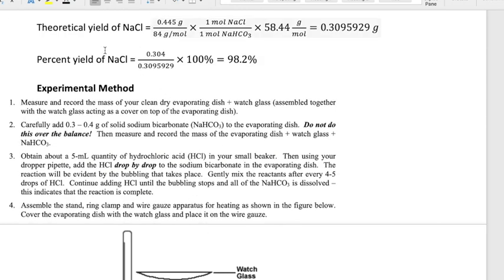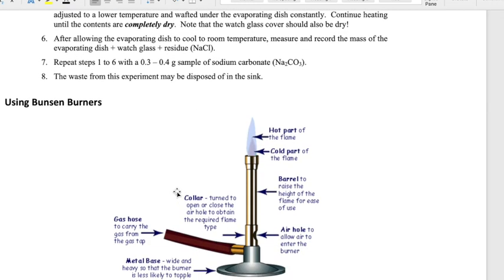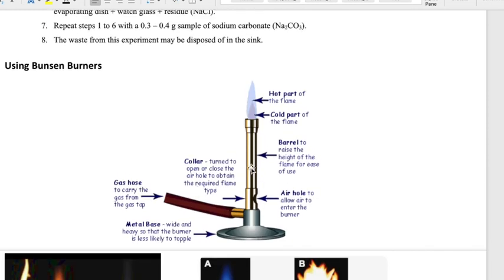A note about using Bunsen burners: a Bunsen burner has different parts that are important to know in order to control the flame. There's a tubing or hose connecting it to the gas source, a metal base so it stands upright, and an important part near the base called the air hole, which you can open or close.